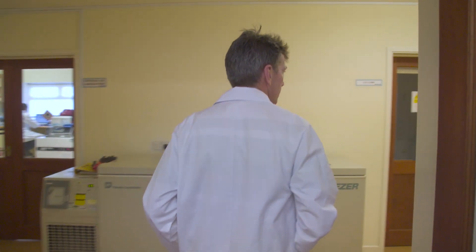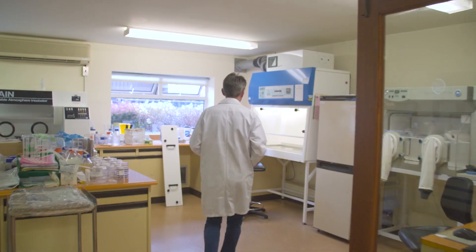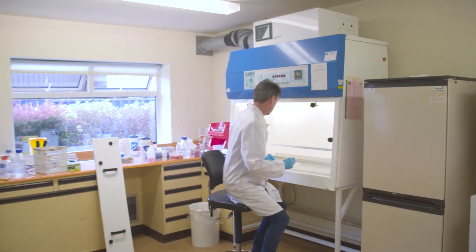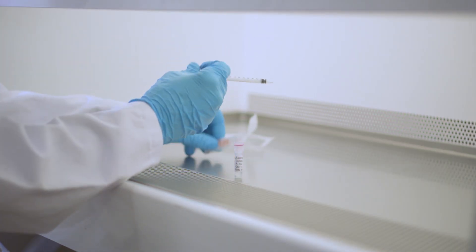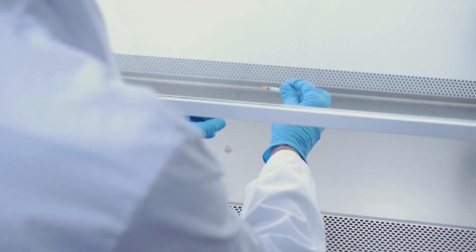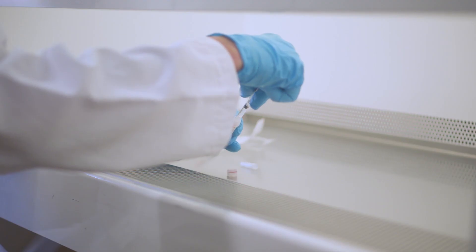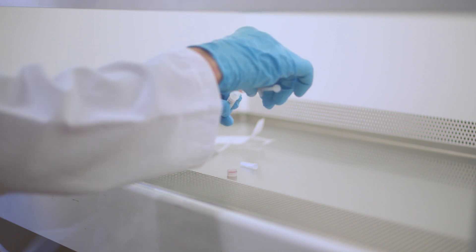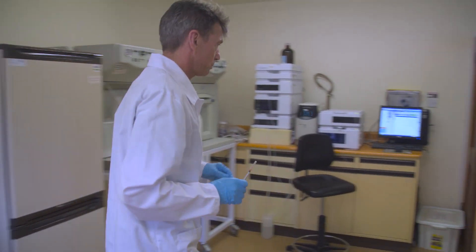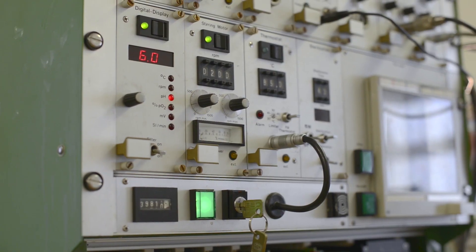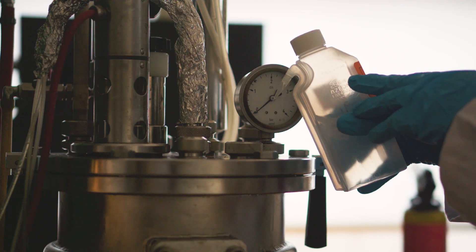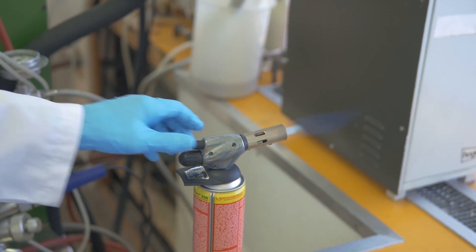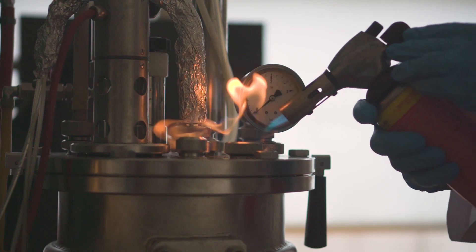Once the vial has been tested for purity, it is used to inoculate a bigger specialized vessel we call a fermenter. In a sterile fume cabinet, the vial is transferred to a syringe. This is then used to seed the fermenter. The bacteria will then multiply from a few million to many billions. The bacteria in the syringe are aseptically added to a 10-liter fermenter which contains a growth media specific to the bacterium.